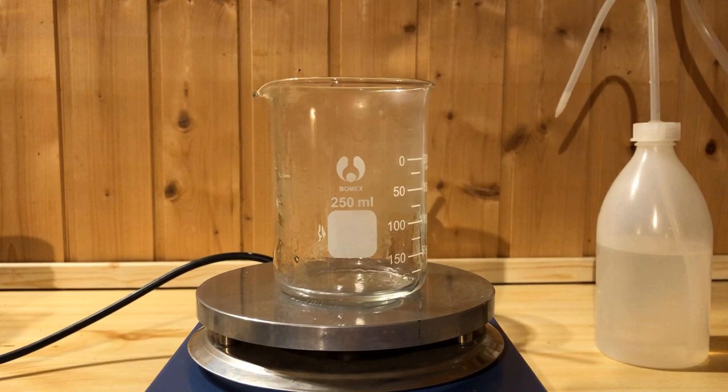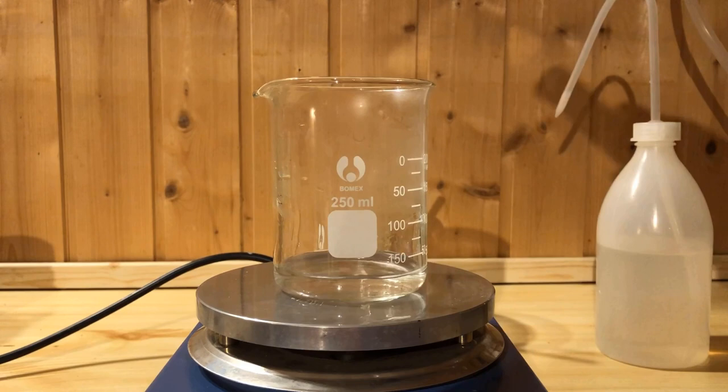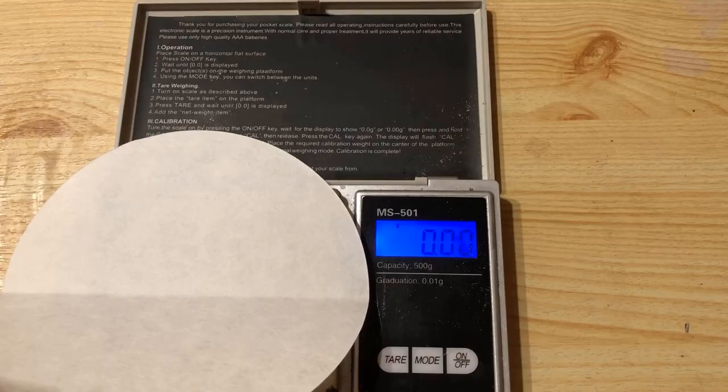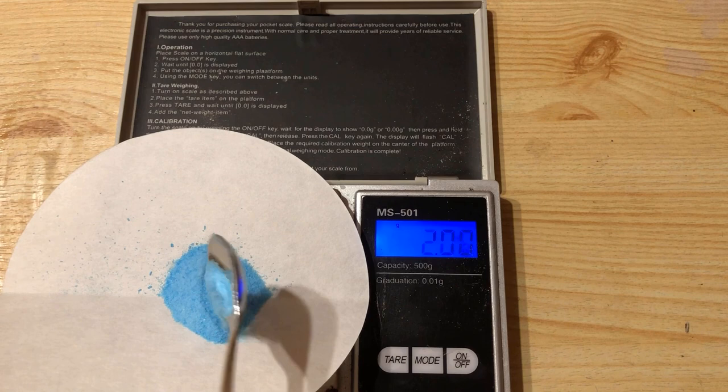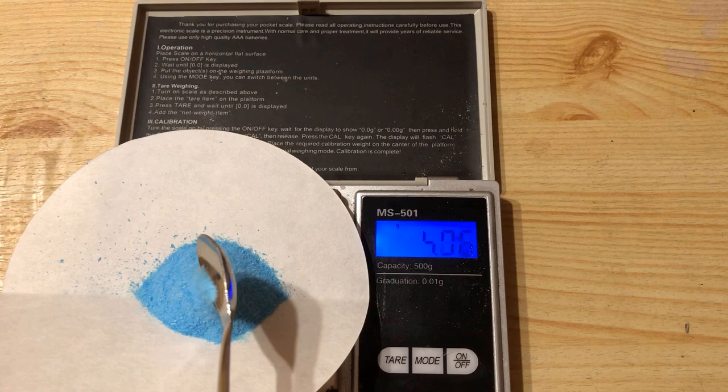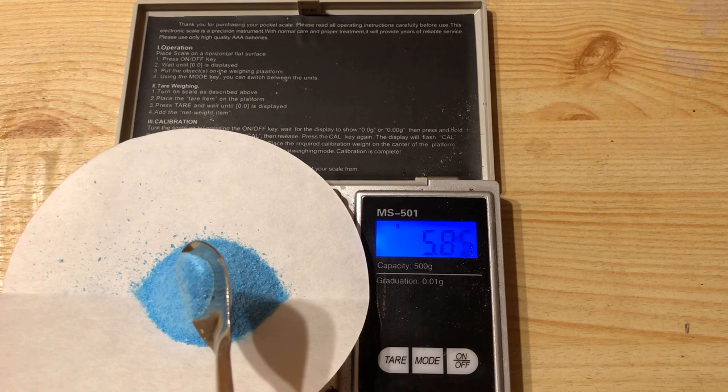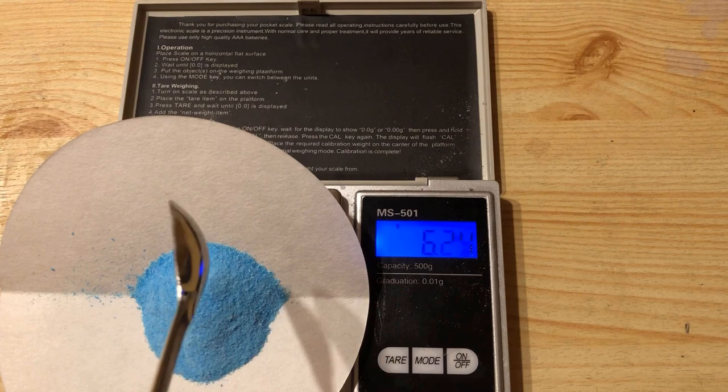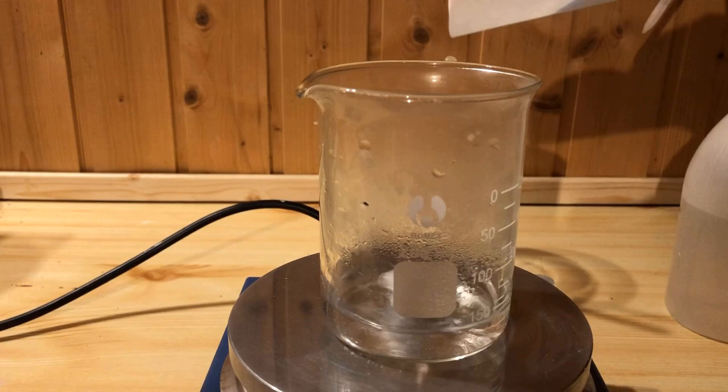A fresh beaker is placed on a hot plate with a magnetic stirrer and 20 milliliters of distilled water is heated. 6.4 grams of copper sulfate are weighed out. The copper sulfate is then dissolved in the warm distilled water.